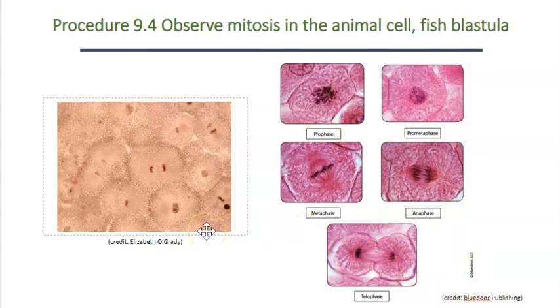So in conclusion, what students need to be doing in the mitosis portion of this lab is really to learn to identify the different stages of mitosis using both the plant and animal cell models, to learn to identify the different stages of mitosis using plant cells, the allium slides, the onion root tip, as well as the whitefish blastula, the animal cells. It's important that not only can you recognize and identify the different stages when you're looking at these models or at these different cells in regards to slides, but that you can also talk about the important events that are happening in each of the stages.